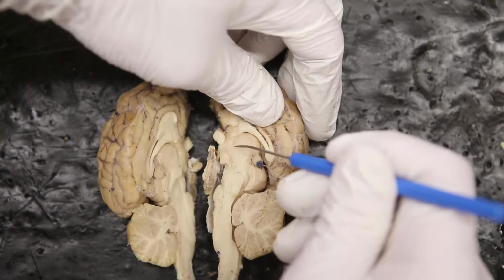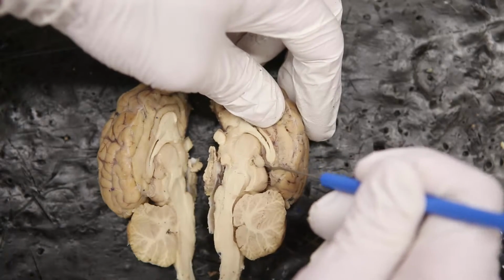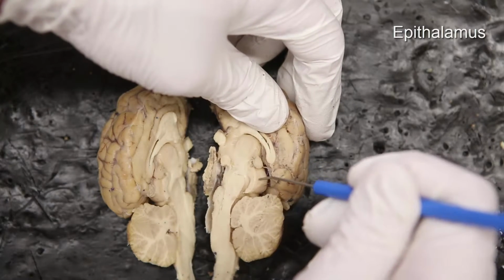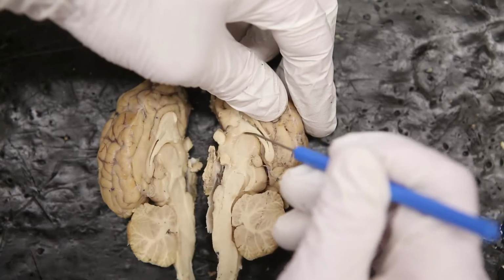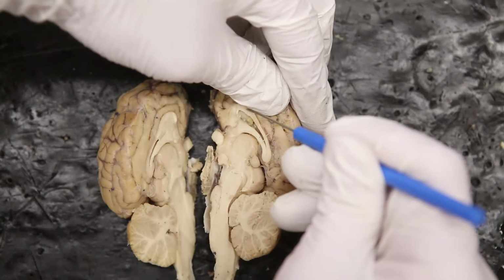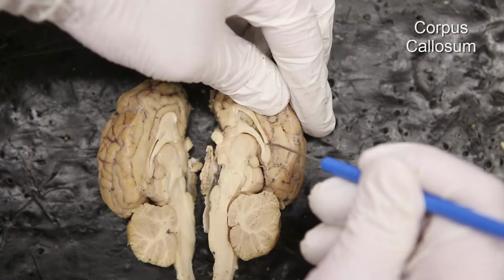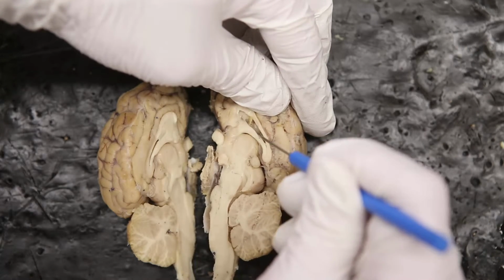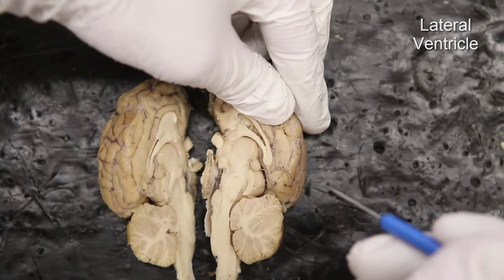If we shift up past the thalamus, this part right here is the epithalamus. Now that is different than this part, which is the superior colliculi. This is the epithalamus. Now from the epithalamus, we can come up to this area right here. This white matter is known as the corpus callosum. Right in between is going to be the lateral ventricle. It's a space that extends into the brain. So, lateral ventricle.